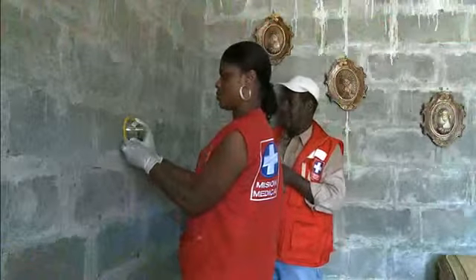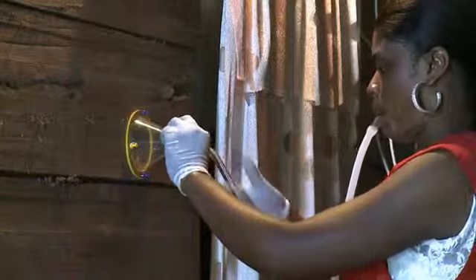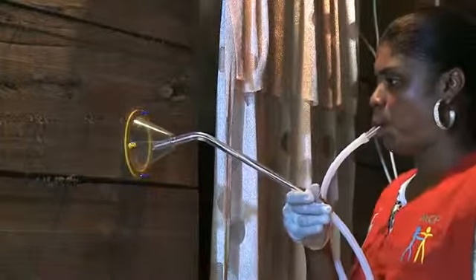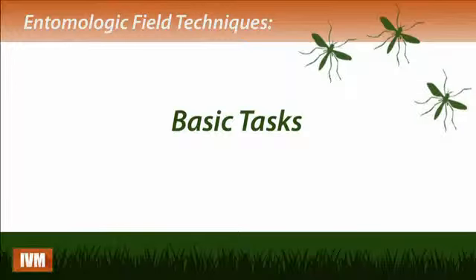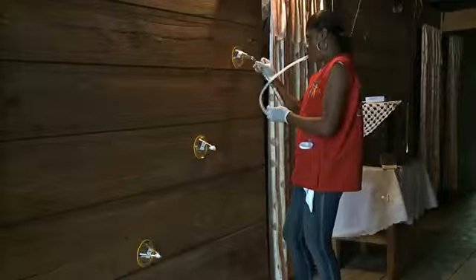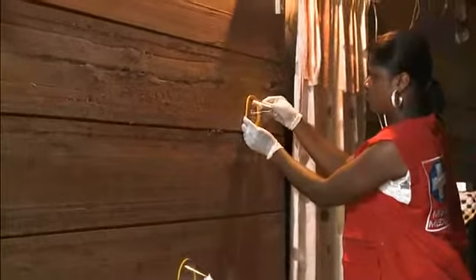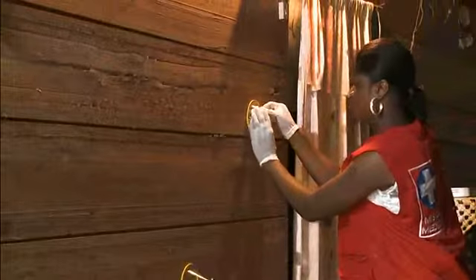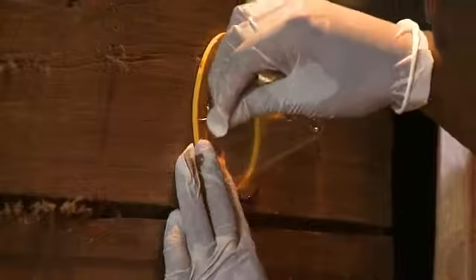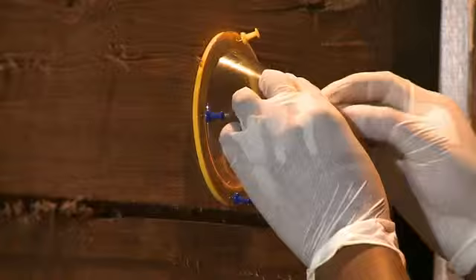In this video, we will show the technique for determining the residual efficacy of an insecticide on a sprayed surface. Cone wall bioassays are used to test residual efficacy of insecticides and to evaluate the quality of residual spraying operations. Residual effectiveness of insecticides on treated surfaces is determined by checking the mortality of the target mosquito vector exposed to the sprayed surface at intervals of weeks or months after the spraying.